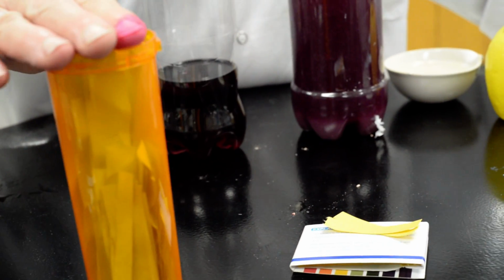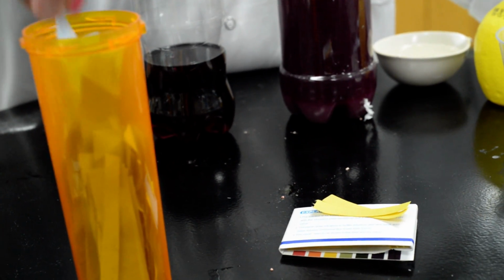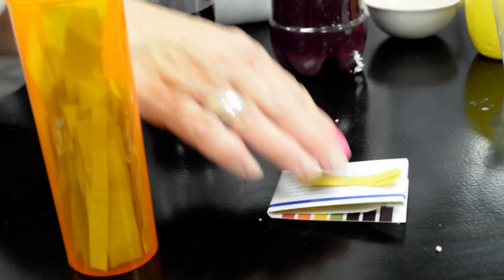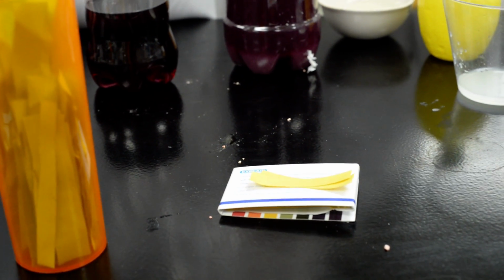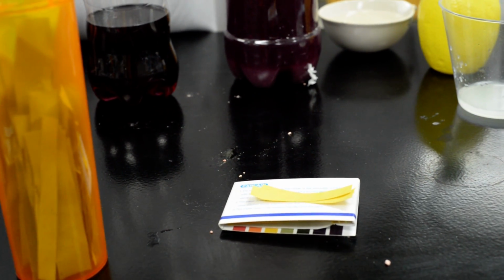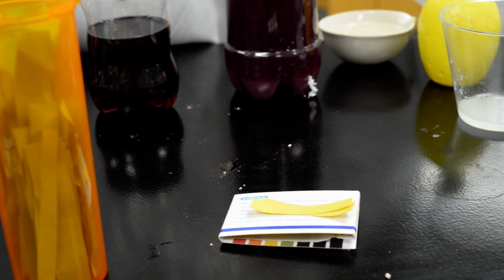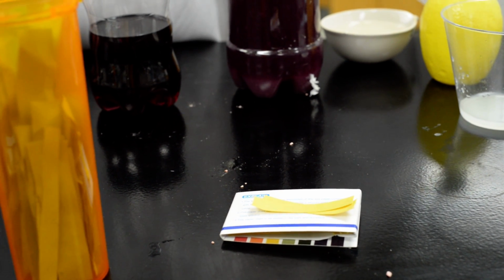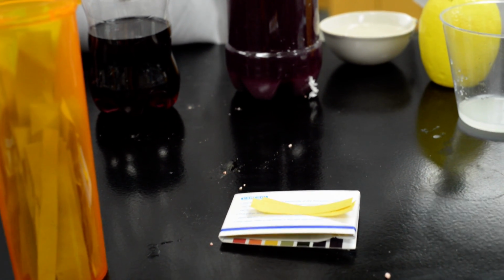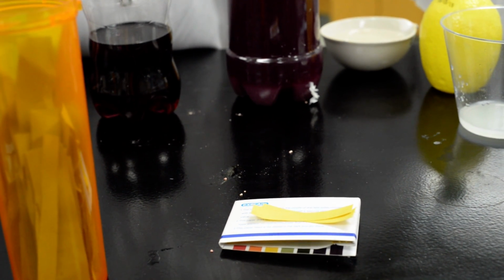I will say that regardless whether you use the homemade, I put them in an old medicine bottle because the light will destroy what you're doing. The same thing with these little fellows, so make sure you don't store them in a light place, but put them in something that will take care of the light so it doesn't destroy the product that you're looking to use. So acidities and bases, some pretty interesting things, could do a lot of data analysis, a lot of hypothesis, and a lot of observation for your students.